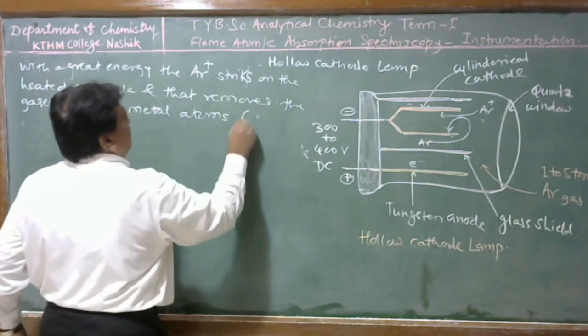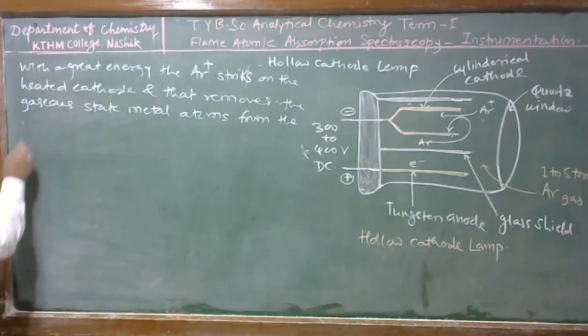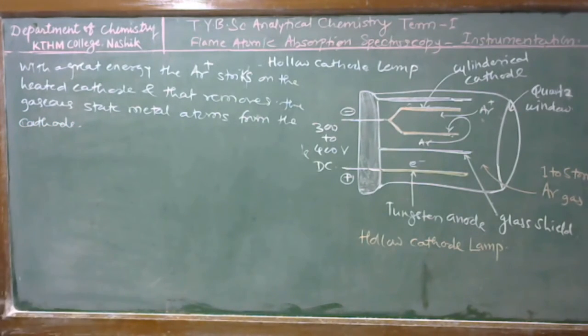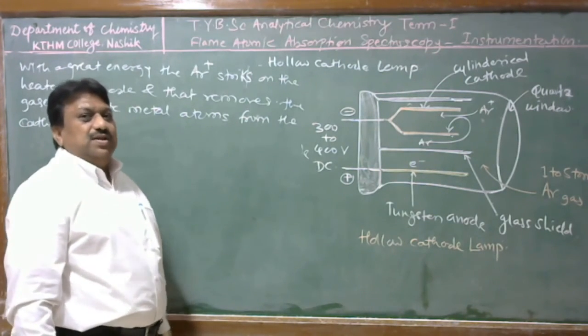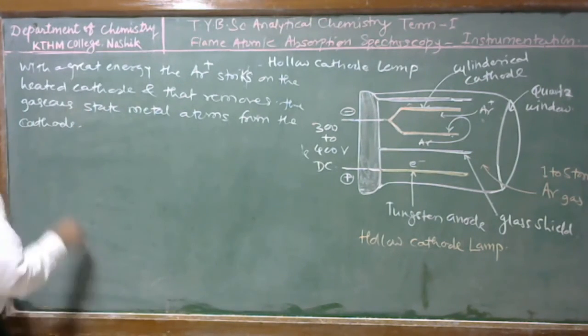Here, an atomization process takes place, that is, gaseous atoms of the particular analyte element are obtained.